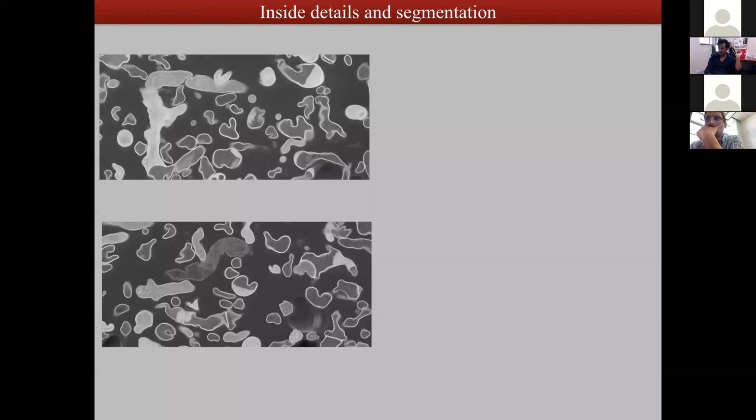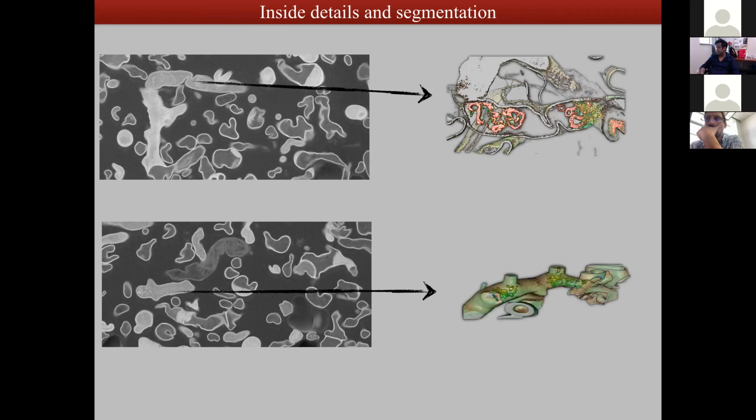So here are two slices. I'm interested in the subcellular region, so whatever is there inside the cell. Here you can see there are two regions. On the top one, I see some very faint membranous structure, and on the bottom one I see some globular protein molecules. Okay, so when I did the reconstruction, this is what it looks like. All right, so I see some densities as globular densities in the bottom portion of that particular bacterial cell region, and the top one has some membranes in there.